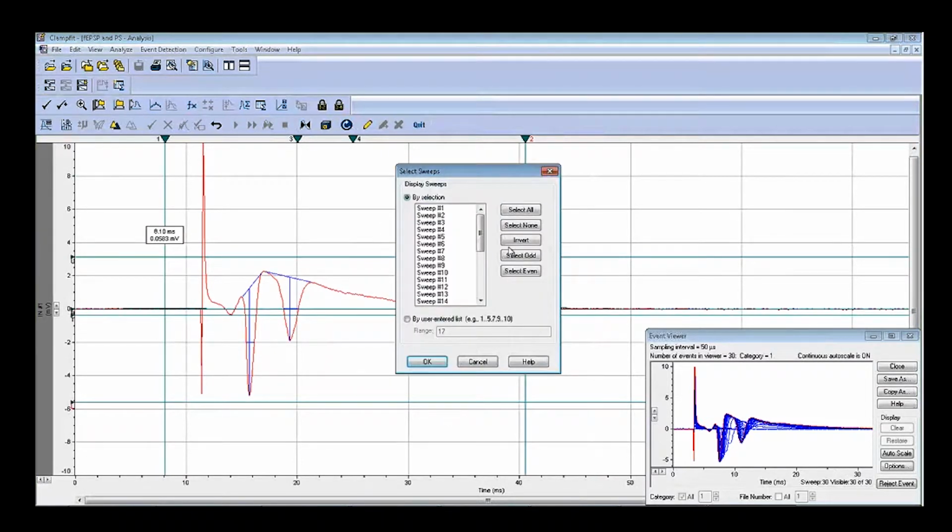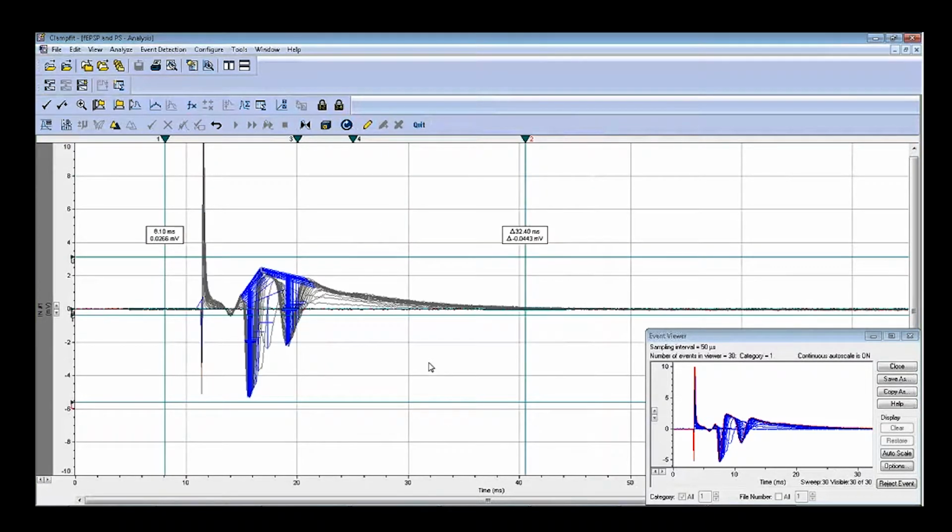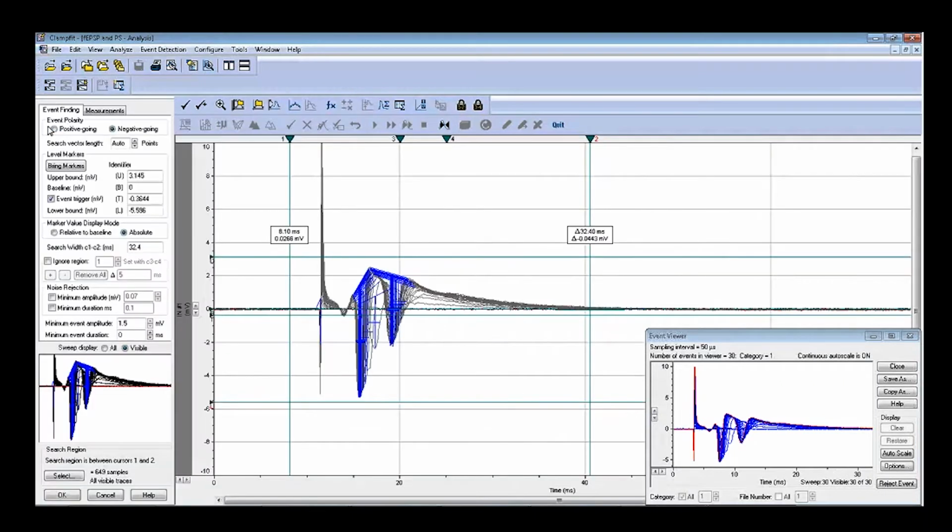Okay. Now, but I still get something like here, right? But how can I do that? Okay, now, go back to here. I want to do some fine-tuning.